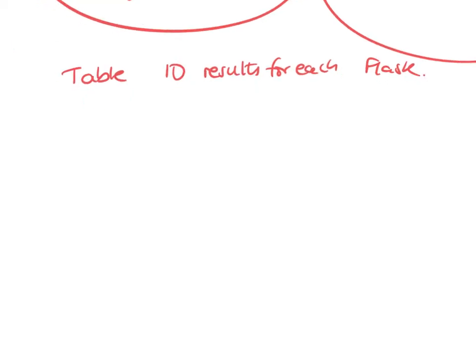Now, you don't need to write down, in that example that we used yesterday, the squares were numbered, like A3, B2. You don't need to do that. You just need 10 figures written down and then put an average or mean at the bottom.